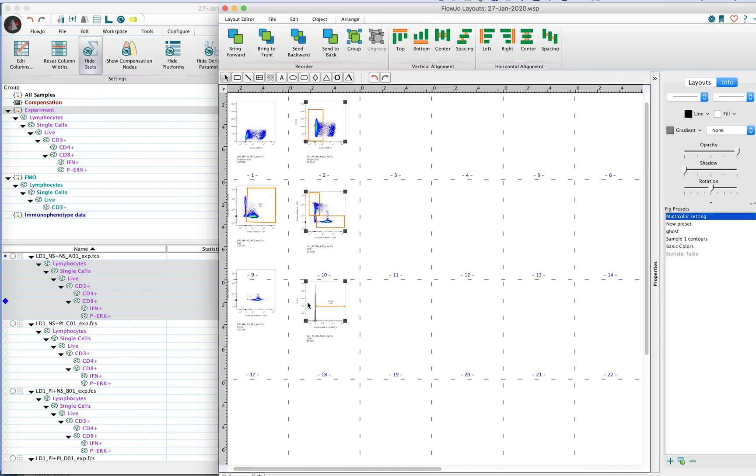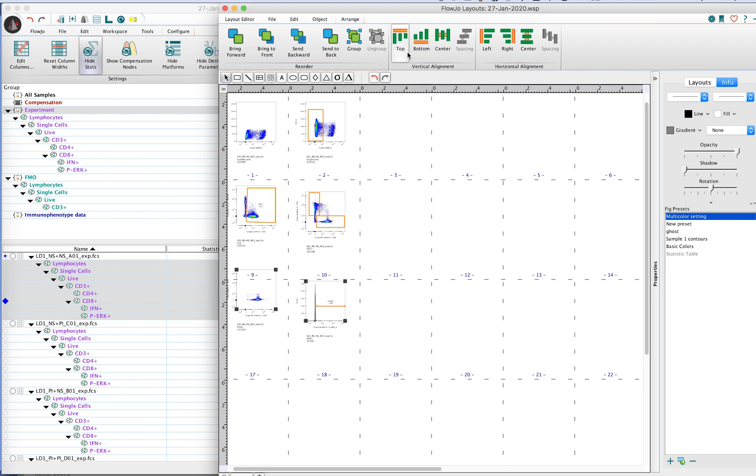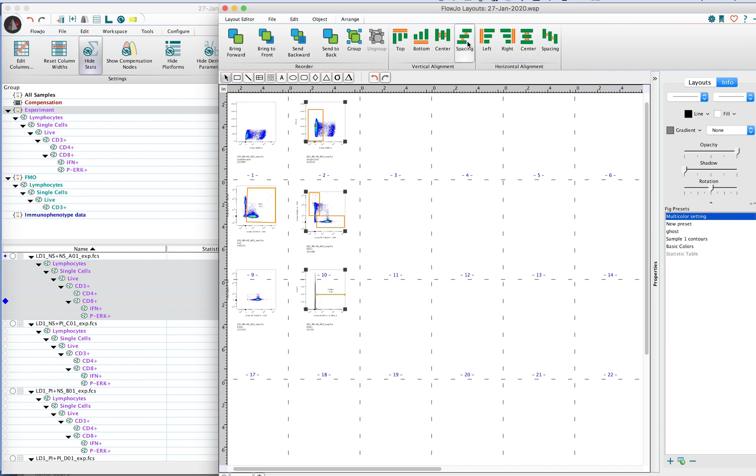So the trick here is to go ahead and click off and pick these two plots here so that you can make sure that those two are going to be aligned properly. Then you can either align these to the top or repeat that process to make sure that the vertical spacing is good. Now you have plots all aligned quite nicely.